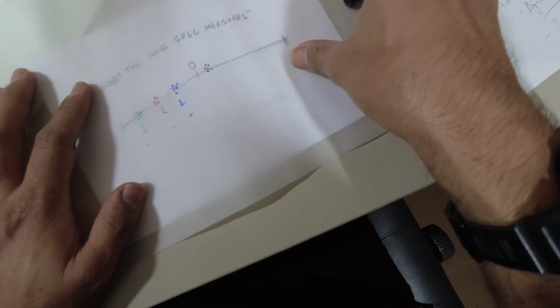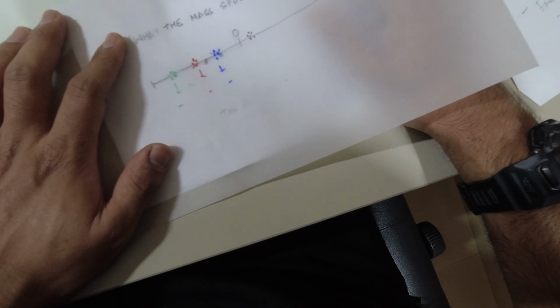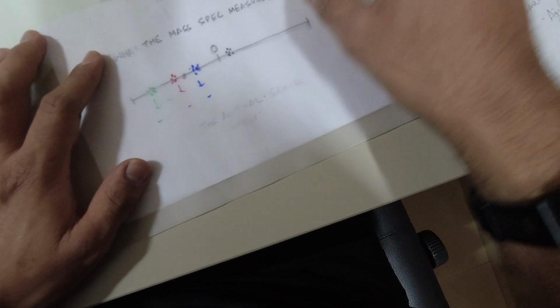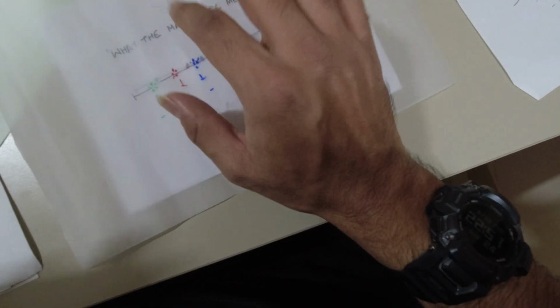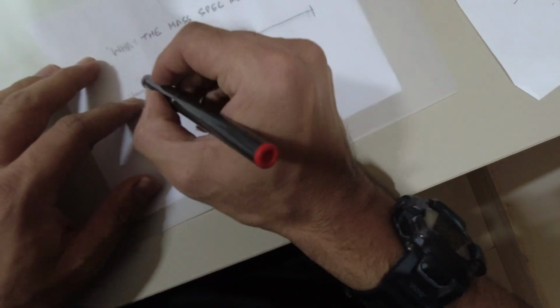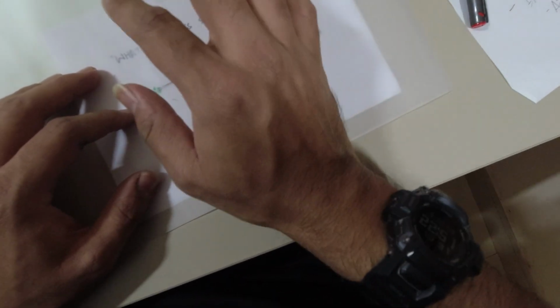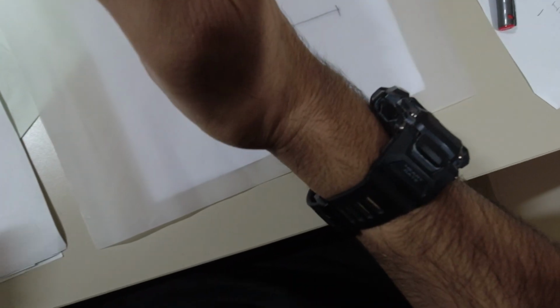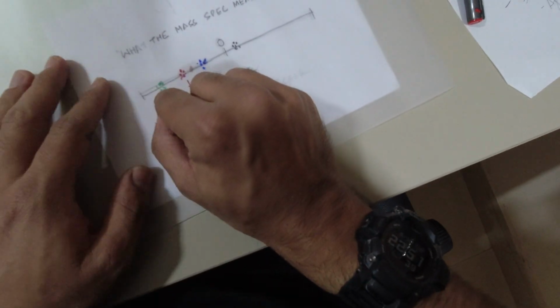And I think that's what I'm doing when I'm changing the VPDB or the VSMOW values for the house gas in my software. And as long as I'm getting all those dots clustered at one place, it should be good. It doesn't have to be accurate, but it just has to be super precise. It's like precision over accuracy. As long as they're clustered together, I think I'm good to go. That's what I've sort of understood.